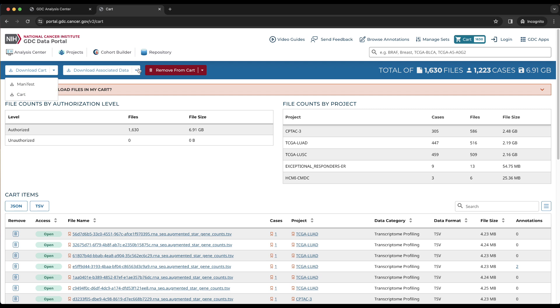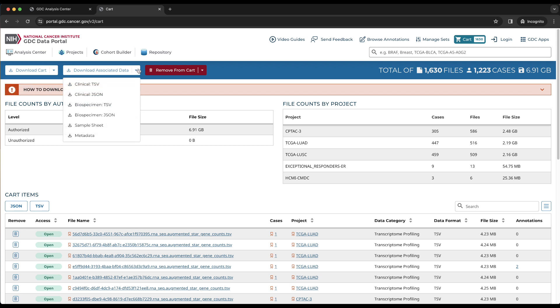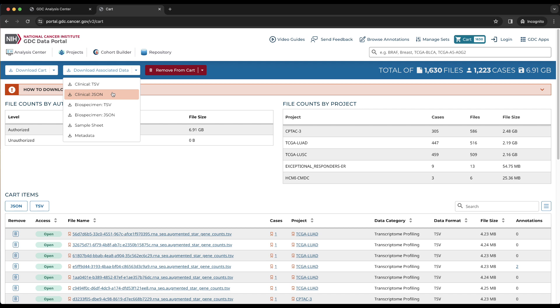The download associated data button allows for metadata about the set of files in the cart to be downloaded. There are six options here. Clinical data about the cases associated with the files can be downloaded in JSON or TSV format. Note that TSV formatted clinical data is separated by entity type, since many-to-one relationships are present in GDC clinical data.